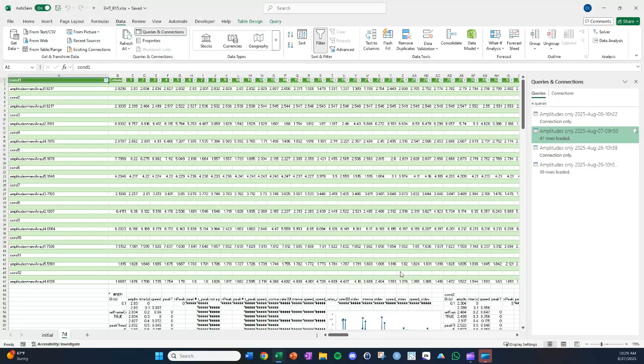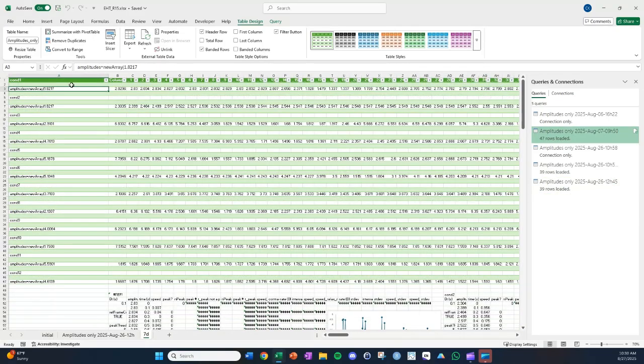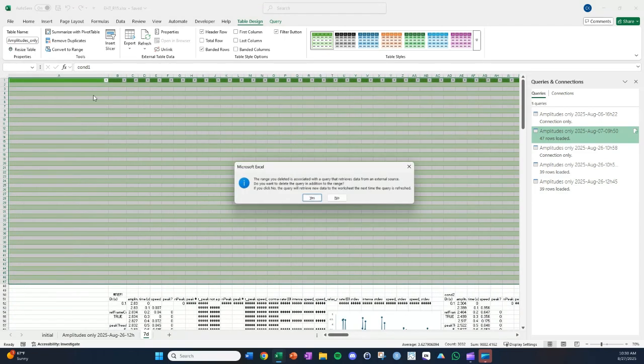And just to clarify, the reason I'm not using the results sheet is because this process in Excel I have higher confidence in. This is something that you have a good deal of control over, using it by yourself in a spreadsheet in Excel, not relying on whatever sort of threshold values you inputted into MYOCYTER and whatever MYOCYTER is doing internally automatically behind the scenes in that sort of black box. So removing the black box, getting full insight into how to analyze these data.